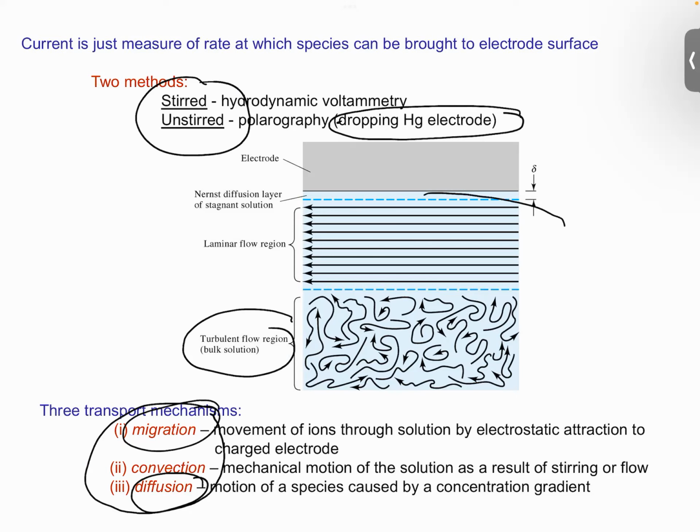So stirring, of course, is very helpful, so that you have what we call a homogeneous process. And then the electron transfer is of course very much easier to happen if we have stirring.